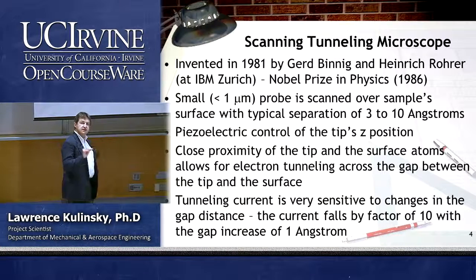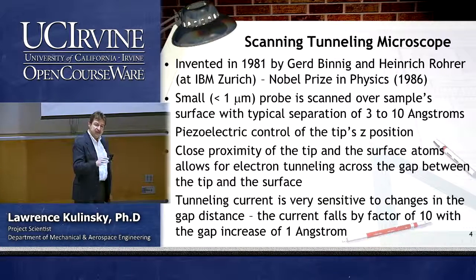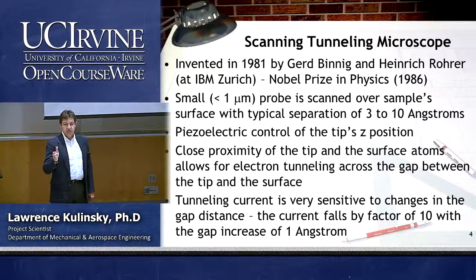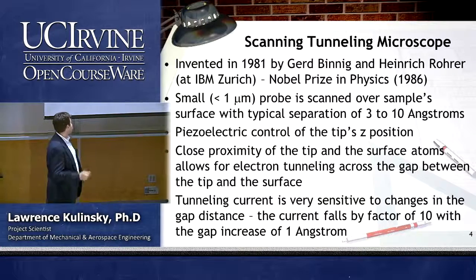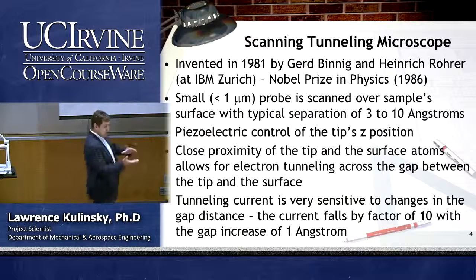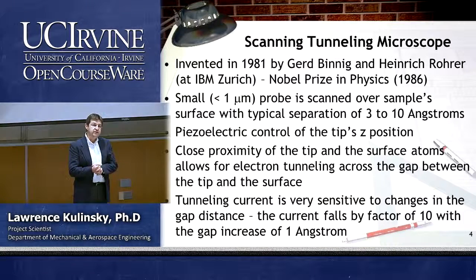The key to this technique is very finely tuned control in X, Y, and Z direction, and a piezoelectric stage is used. Piezoelectric material is a ceramic that changes its dimensions as you apply electricity. Close proximity between the tip and the surface allows tunneling. Tunneling is a quantum effect.